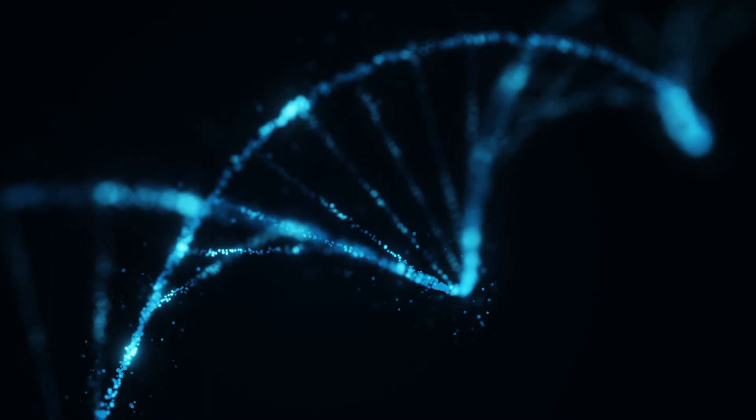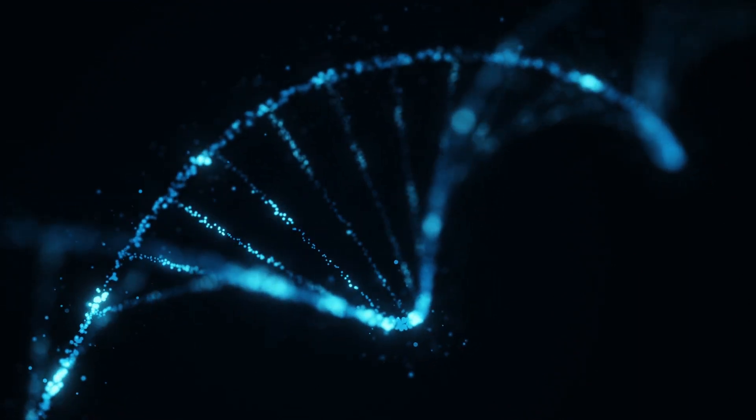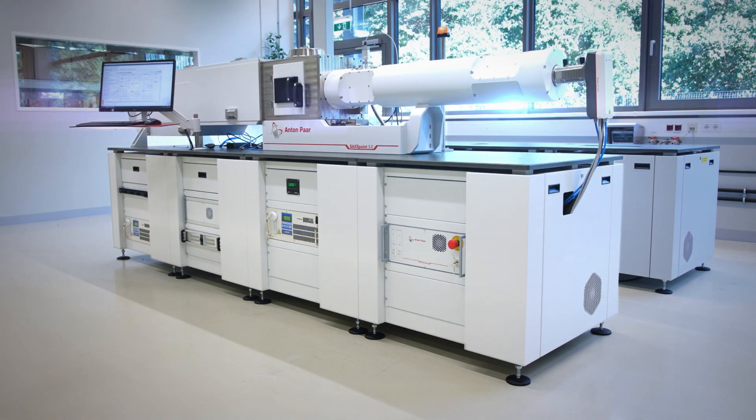We know this because we have something in our DNA, too. X-ray analytics.